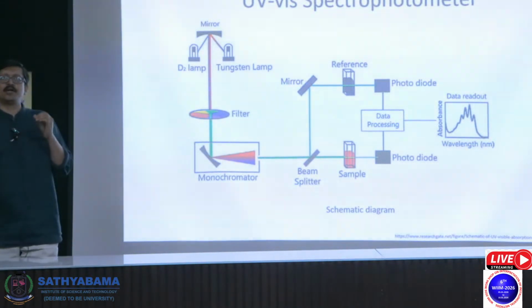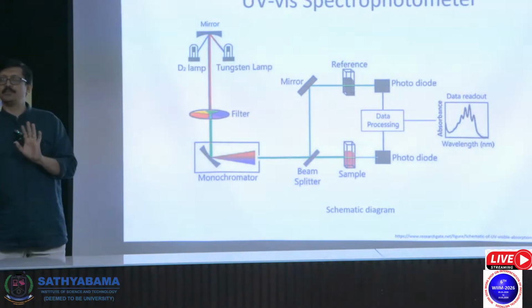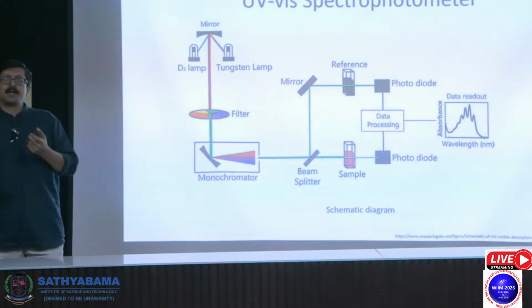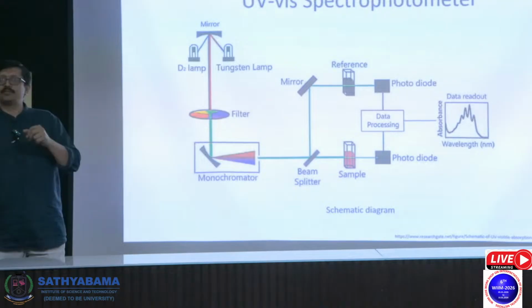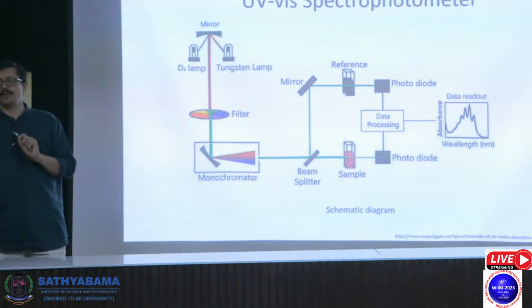It's not about your sample at all. This noise is not due to your sample. Signal is due to the sample. Noise is mostly coming from the electronics part, the random disturbances from the thermal movement of the electrons in the detector, or from stray light, not the light that you use for exciting the sample.